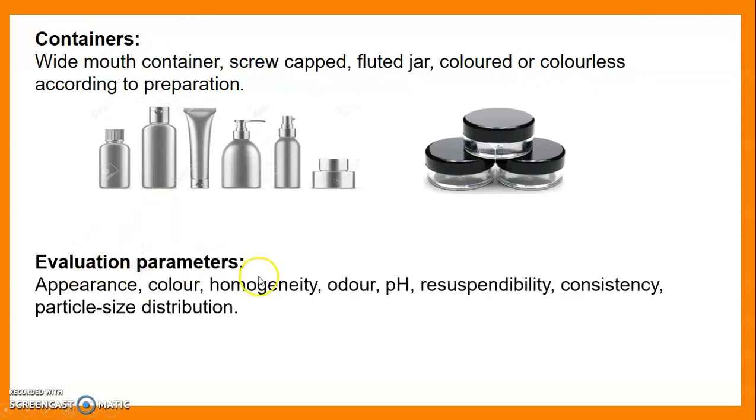Then evaluation parameters. Lotions can be evaluated on the basis of appearance, color, homogeneity, odor, pH, resuspendability, consistency, particle size distribution, etc. Then we move towards the actual practical session.